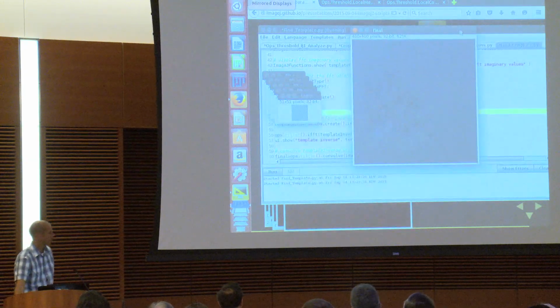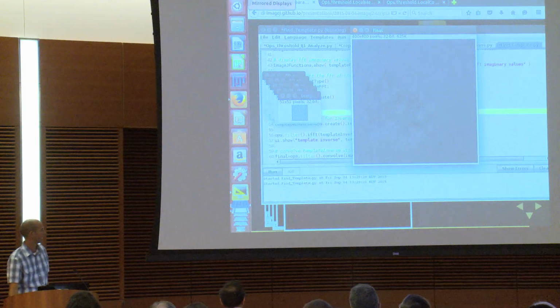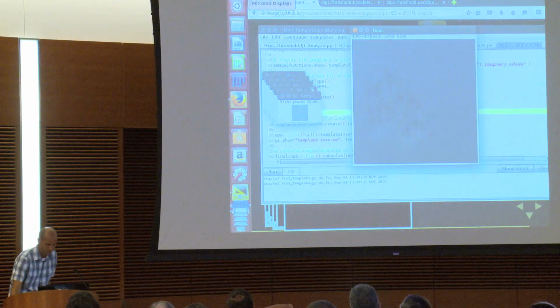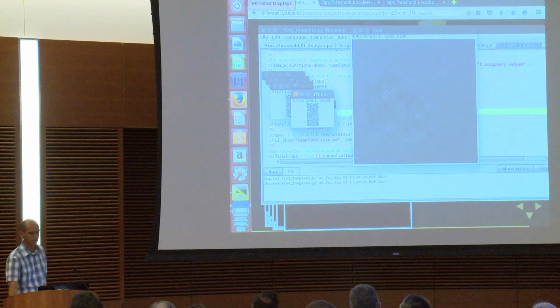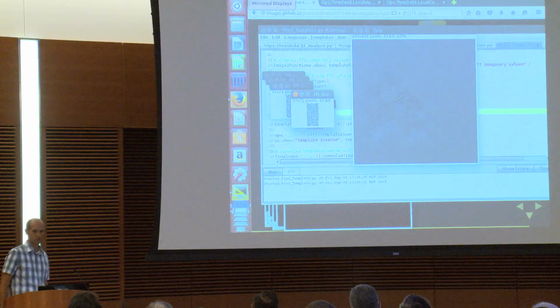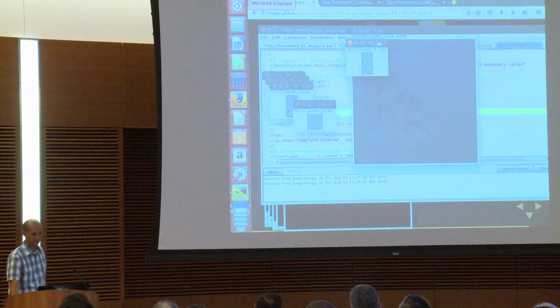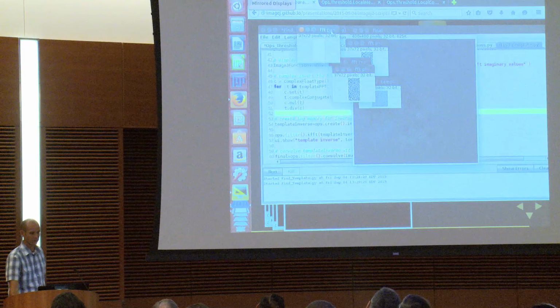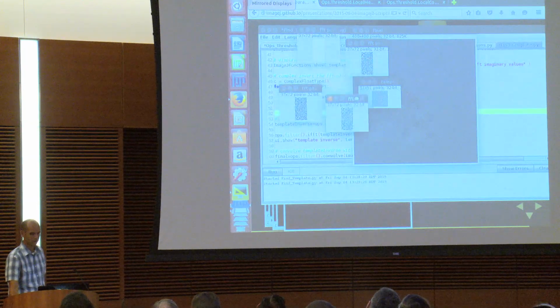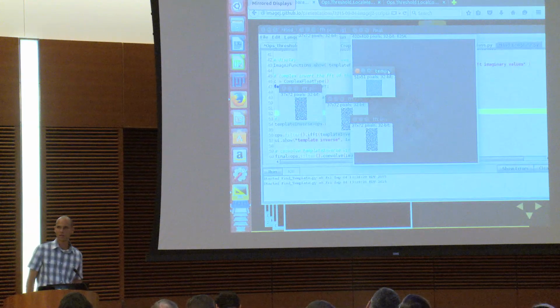So this is just a little toy example, but it tries to find a template in a bigger image. In this case, the template was cropped directly from the image, so it was pretty simple. I'm not sure how well this strategy would work on general images. But the main point of the example is just to show you a little bit about how to work with FFTs. Then you get all the different power spectrum, phase spectrum, and the imaginary numbers.